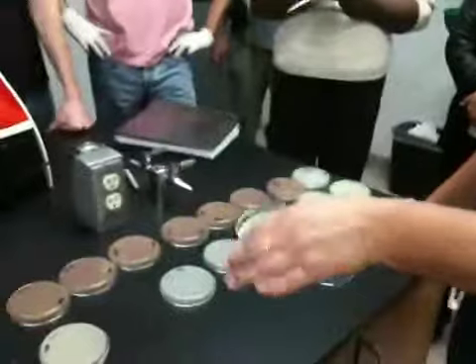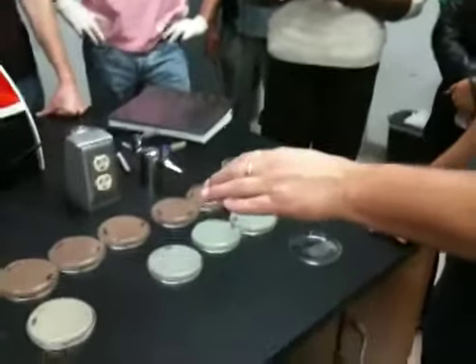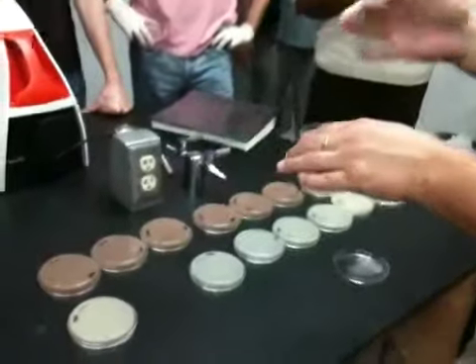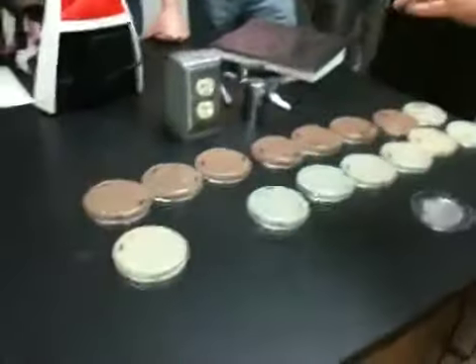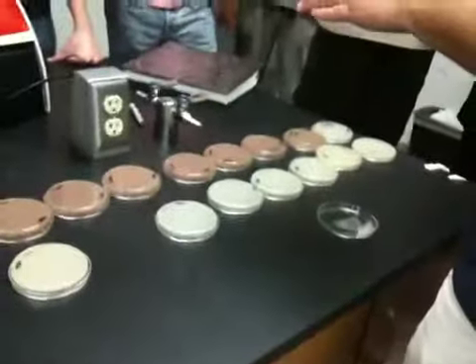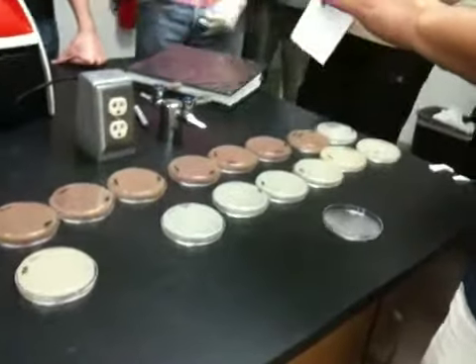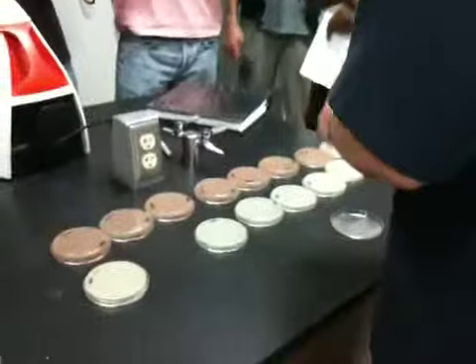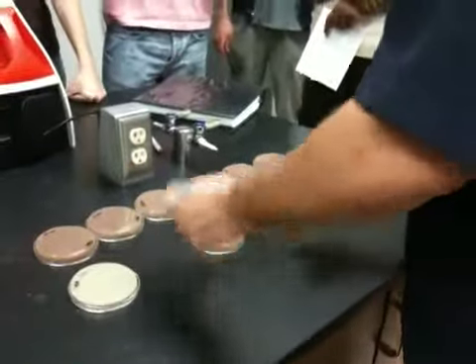Right? So typically, it could have been that after the UV was actually done something fell in, or because it's a bacillus, it could have been an endospore, and the endospore is protected. Okay? But everything else you can see, so it's effective even at less than 1 minute.